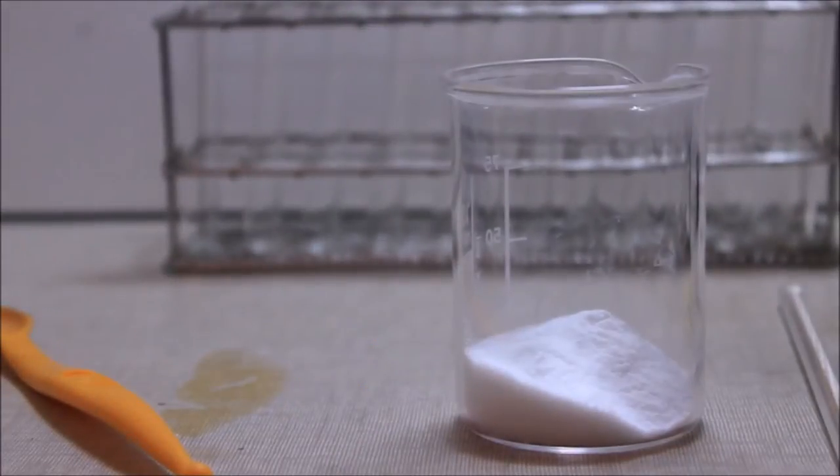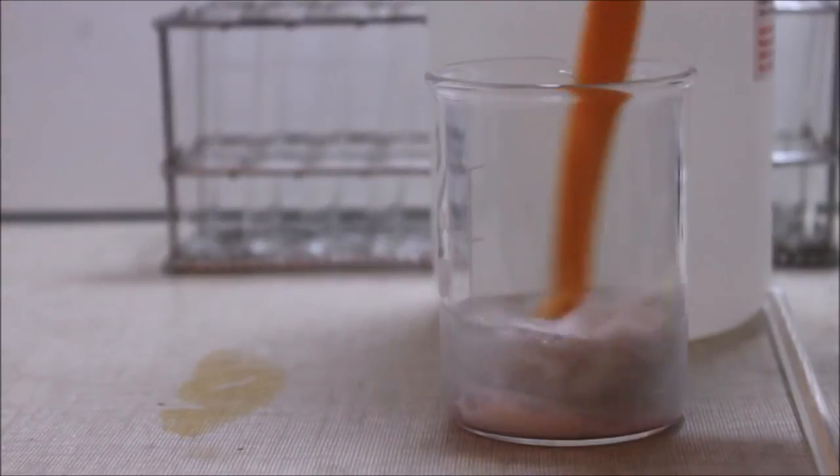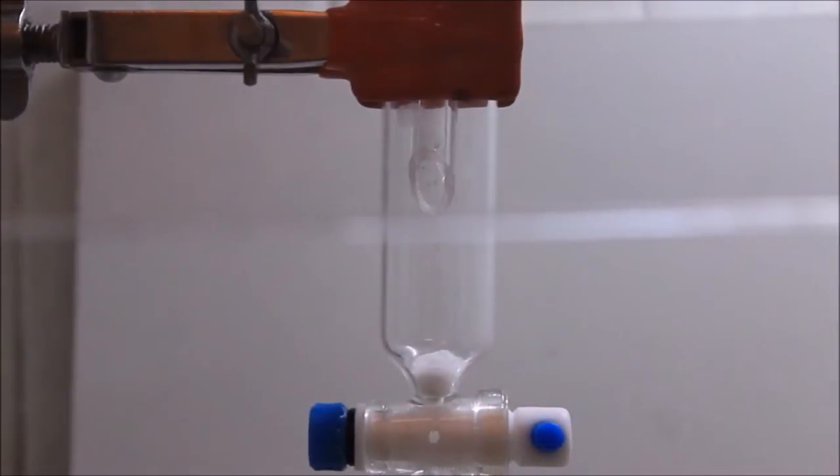Column chromatography is an analytical chemistry technique used for the separation, identification, and quantification of the main components of a sample. This technique is usually employed by organic chemists in order to purify the product of a reaction or to isolate a given component from a sample.